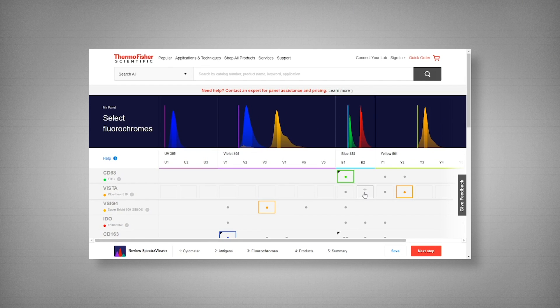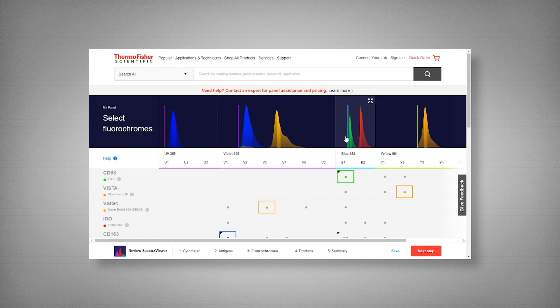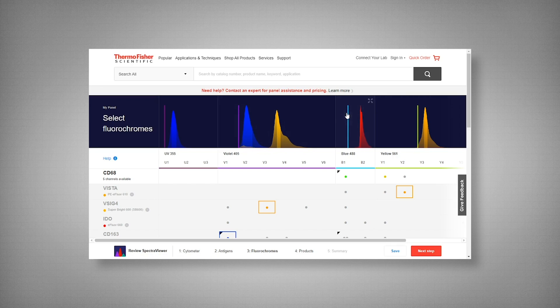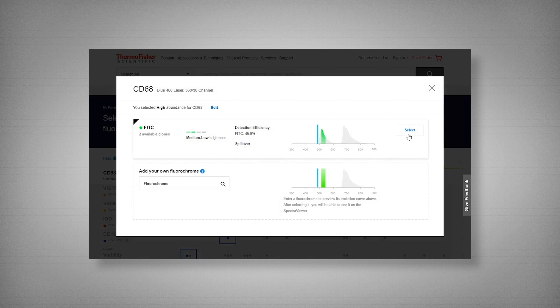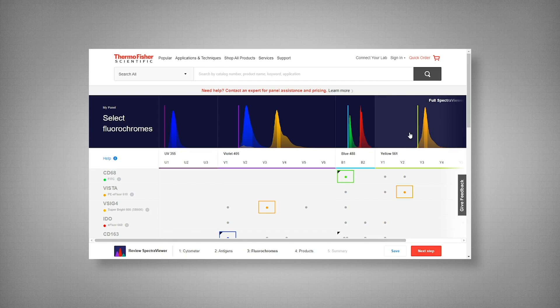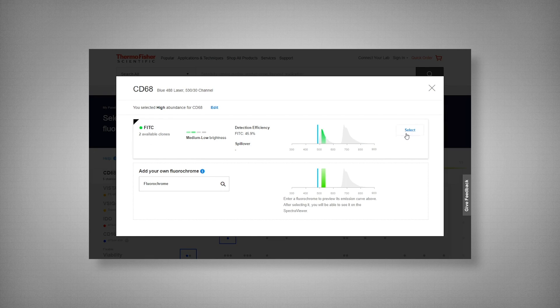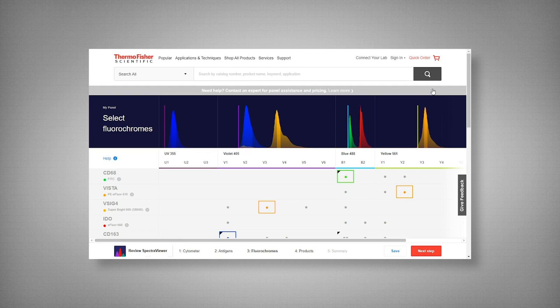A great thing here is also our built-in spectra viewer to look at our emission spillover and spread. Now this populates as you pick your colors. So if we go back to our CD68, I will deselect, and you can see here that it's been dismissed. And we will go back and select, and now it appears. Another great thing when choosing your color is that it also tells you how many clones and which clones in particular are available for that fluorophore.